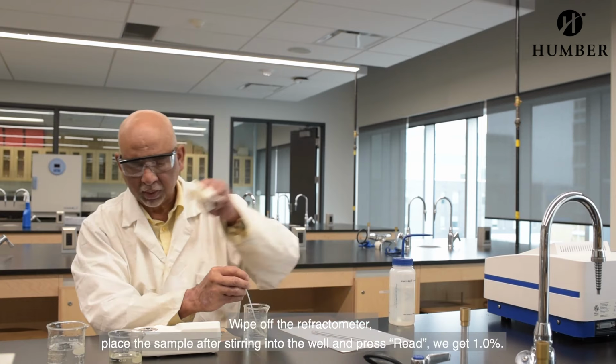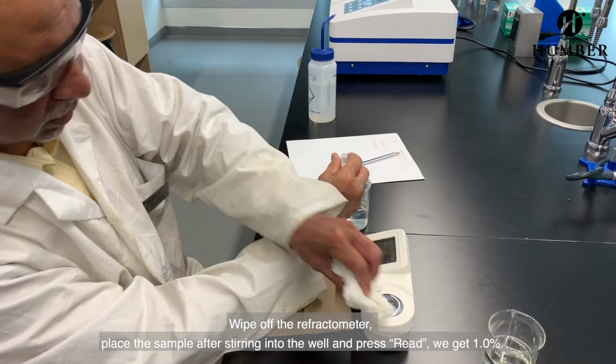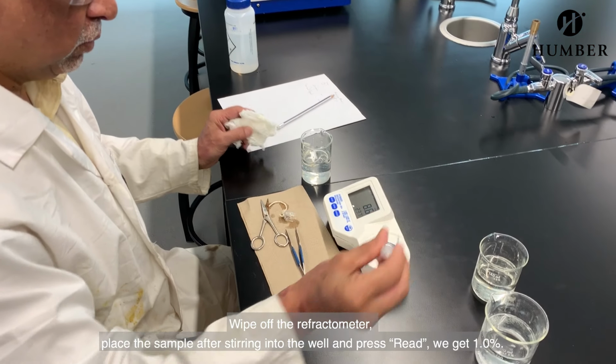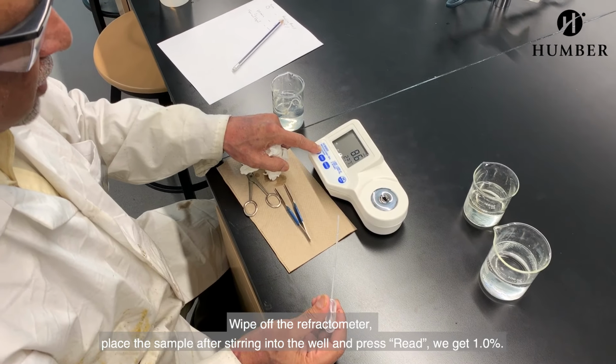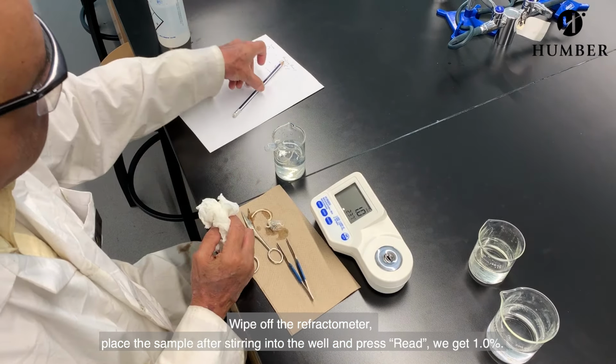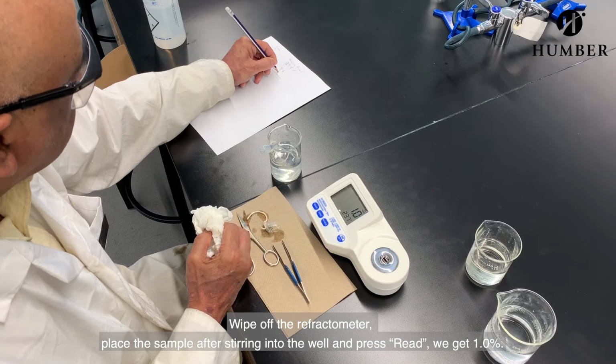So we need to wipe that off and fill this well again and press read, and whatever reading we get, it's 1%. So I'm going to put in here 1%.